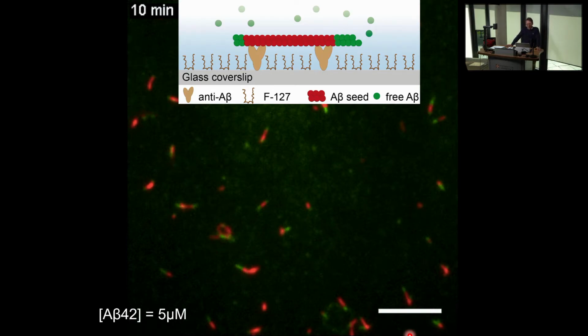So on this, I just show you finally a few examples of things that we do in our own research with this technique. What we've done here is apply this method to allow us to image individual molecules that cause Alzheimer's disease.